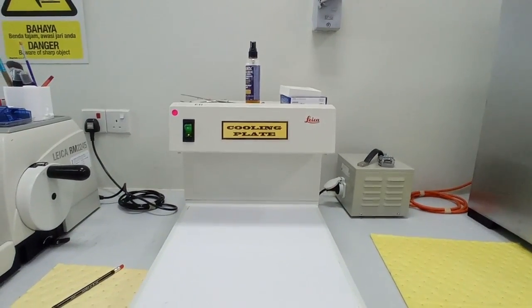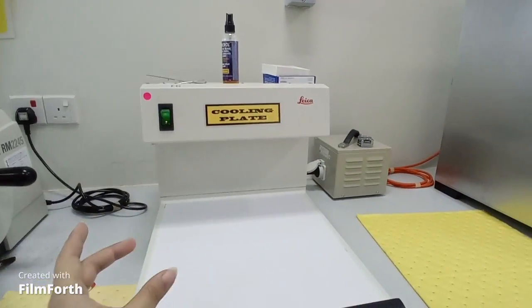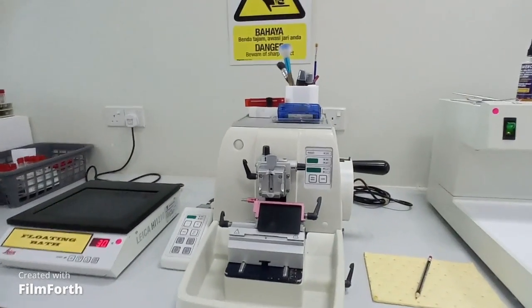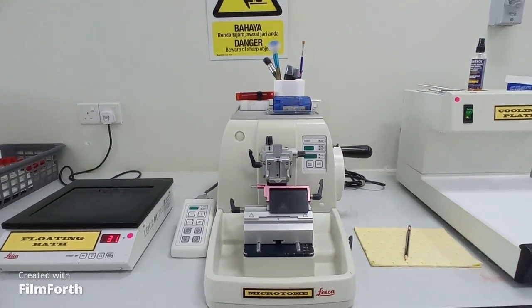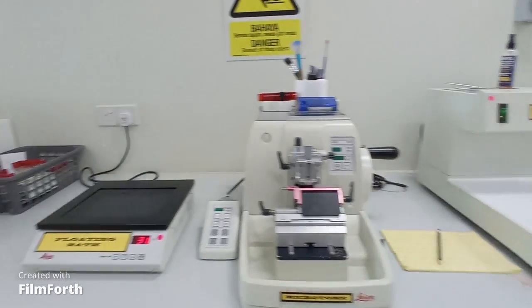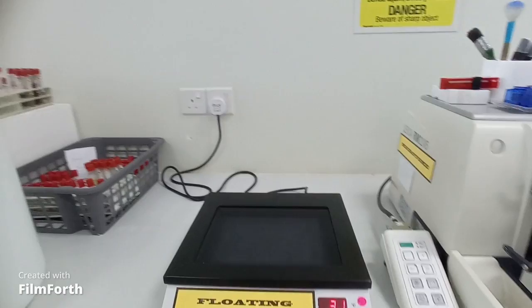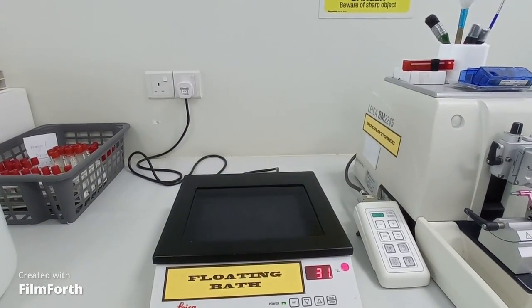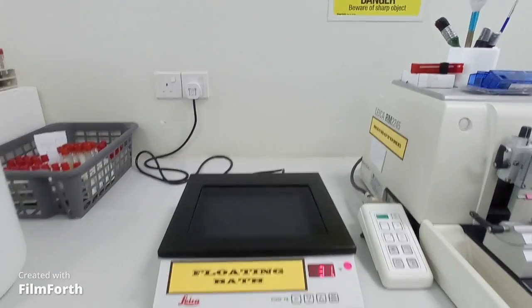This is the cooling plate where we put our blocks to cool them down first. This is a microtome machine where we cut the tissues into thin sections, and this is a floating bath. Here we put the microsections of tissues and scoop them onto the slides.